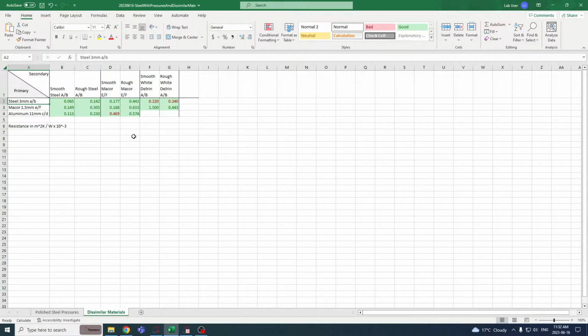So this is to create a conversation. Probably this will show up in various forms based off of the configuration of your material and how you're going to use them. But we really want to create a conversation around all the different variables you can introduce. The one variable we haven't shown you here is the introduction of temperature. So measuring some of these phenomena with temperature to really map out a full understanding of how a material changes with all of the differences.